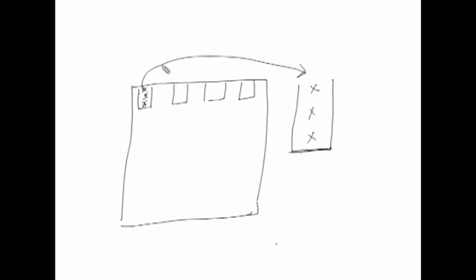Now, obviously, when you have dilute solutions, where the amount of sample you have taken is a large volume, since your analyte or molecule is distributed all over, the molecule closest to the gel interface will enter first and will also move somewhat on application of the electric field. But this molecule of the same analyte will have a time gap when it enters relative to the first one. If I say this is number 1 and this is number 2, then 1 will move somewhere, then 2 will enter in here.